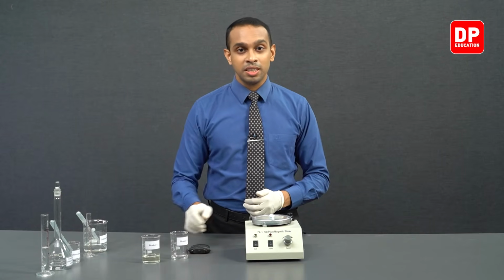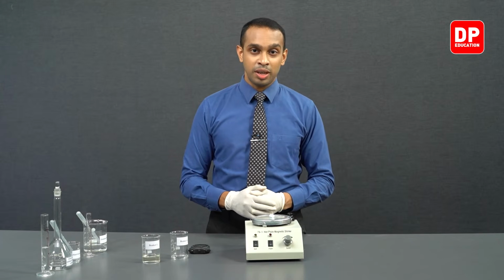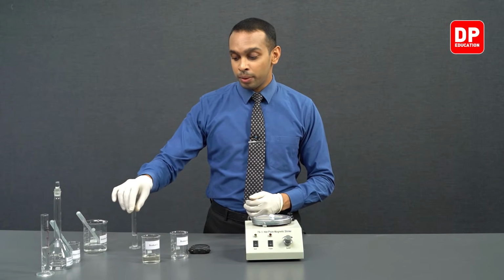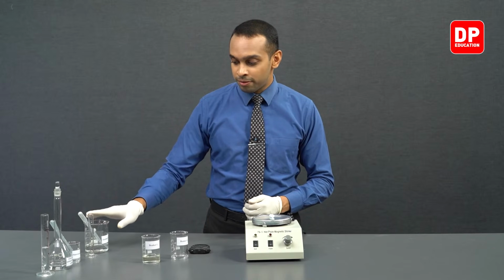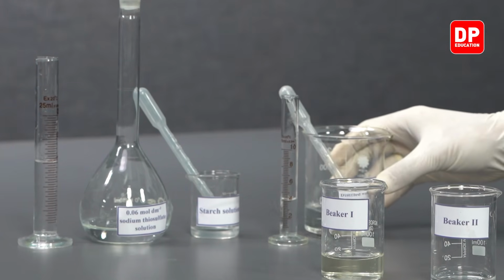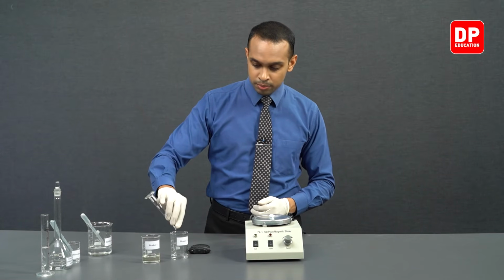So since we have decreased the volume of potassium iodide we take for this reaction, we have to add a little bit more water to bring the total volume up to 50 milliliters. So we have added 4 milliliters of water into this measuring cylinder. As you can see here, this is distilled water. So we can transfer that into our beaker 2.